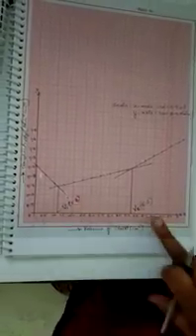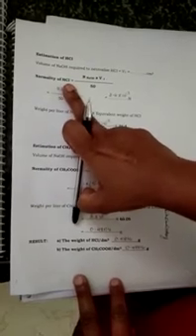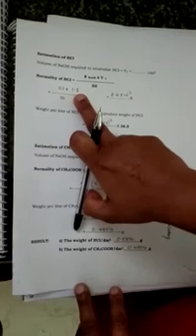Note down the V1 and V2 values and calculate the amount of acetic acid as well as hydrochloric acid that is given in the beaker using the formula. First, let's estimate the amount of hydrochloric acid using the formula N1V1 is equal to N2V2, where N1 is the normality of hydrochloric acid. Sodium hydroxide is a standard solution whose normality is given. Then V1 is obtained from the graph. The original volume taken in the beaker is 50 ml. So you get the normality.